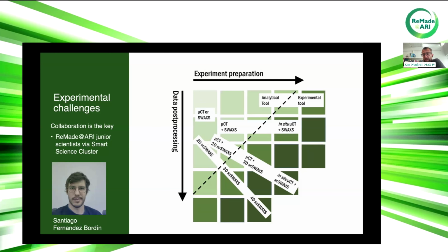Now there are some techniques here that we don't discuss in this talk, but let's walk through the scanning SWAXS. In the top left, we have the standard SWAXS experiments. If you start doing in situ experiments, then you need to spend more effort on preparing the experiment. You need more expertise to prepare that experiment.